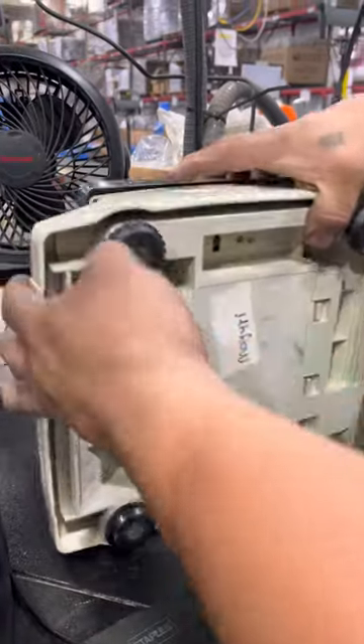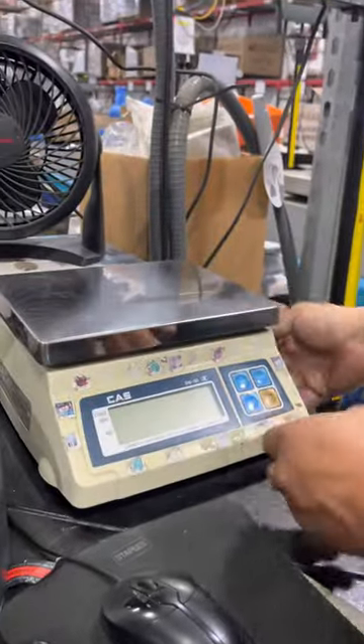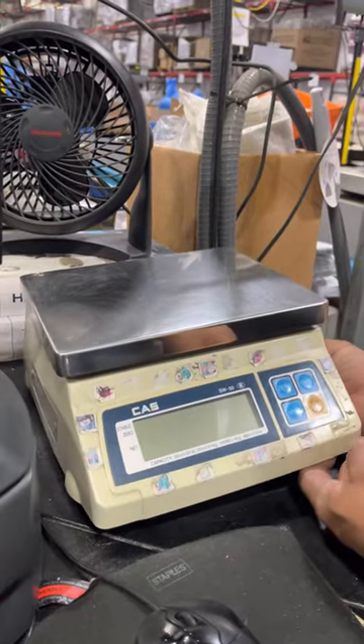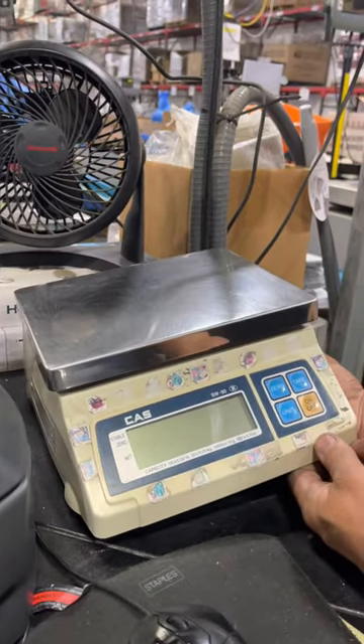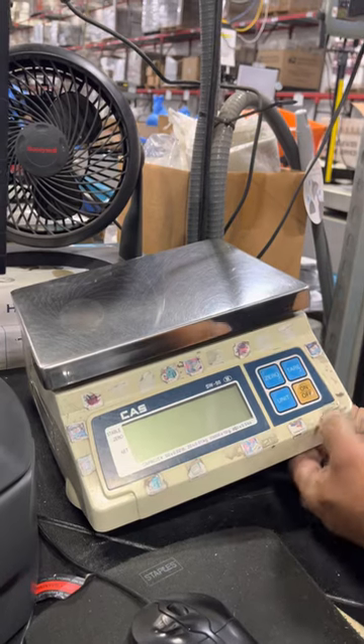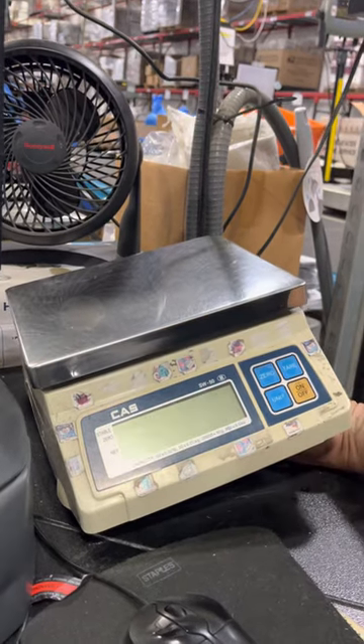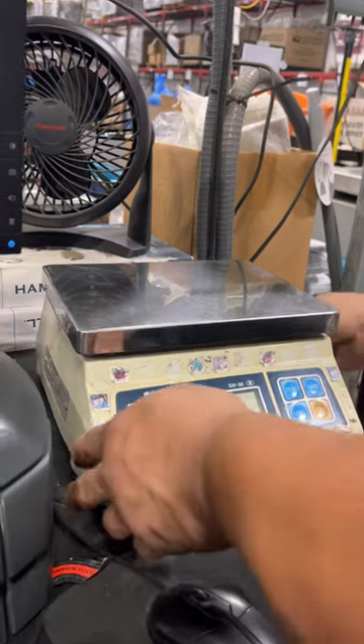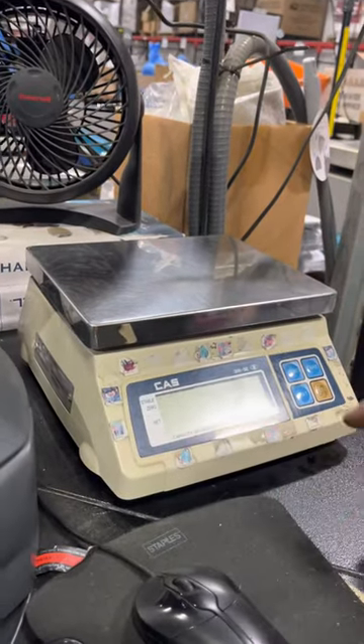Hold it in and power on. You'll see 'CAL' — it will display and flash about three times and then it will go away. At this point you press the on and off key.